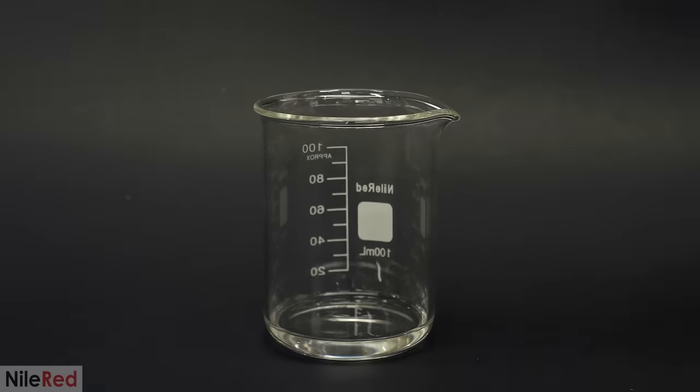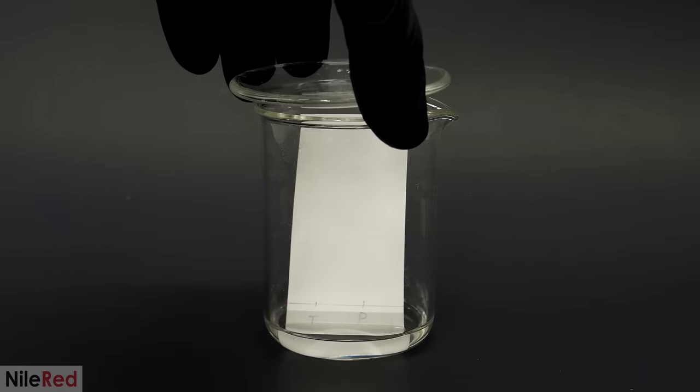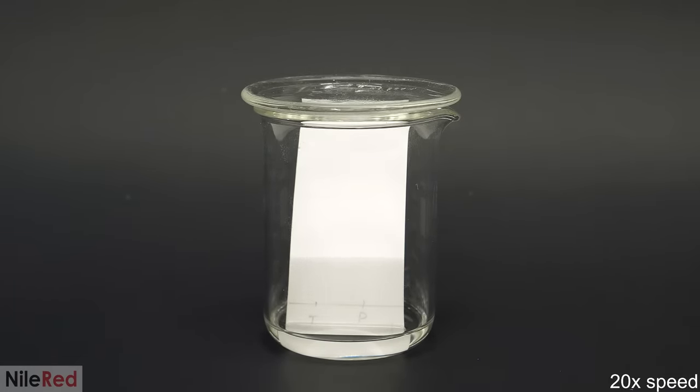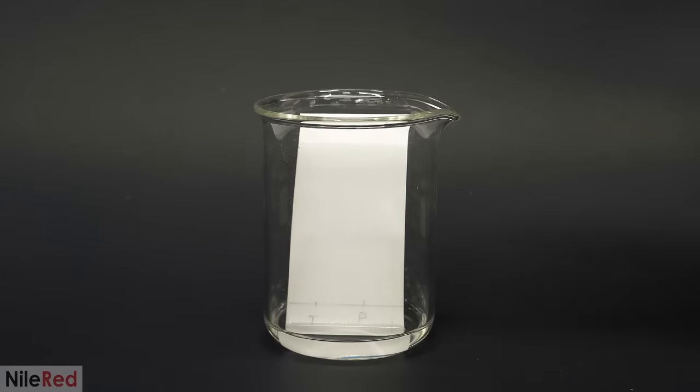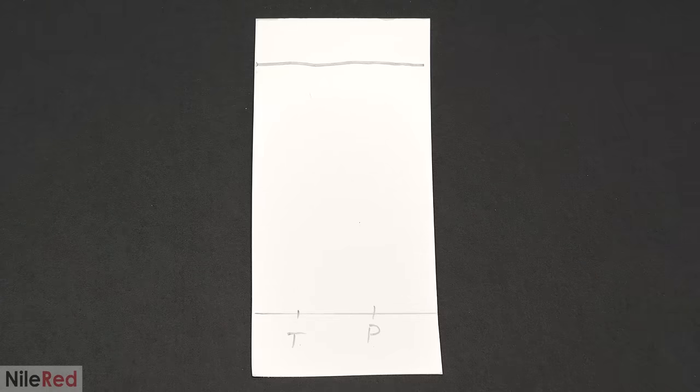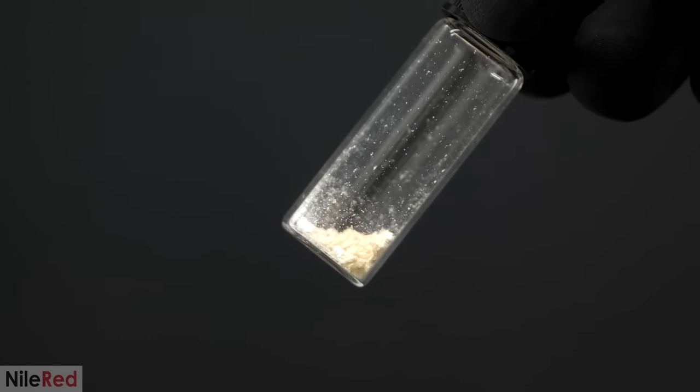I then carefully loaded this into a beaker that had some solvent at the bottom. With this setup, the solvent will slowly climb the plate, and pull the samples along with it. At the same time though, the silica on the plate is pulling back on the molecules, and preventing them from moving. They are still able to move though, and the distance that they travel depends on how much they like the solvent, in comparison to the silica. When the solvent got close to the top, I pulled out the plate, and I let it dry. I then shot it with my UV light, and I saw that my extracted sample had traveled the exact same distance as the pure caffeine. There were also no other spots, which told me that what I had was mostly caffeine. There was a bit of darkness around the top though, and this was probably from a small amount of impurity. So between this result and the melting point, what I had here was definitely caffeine.